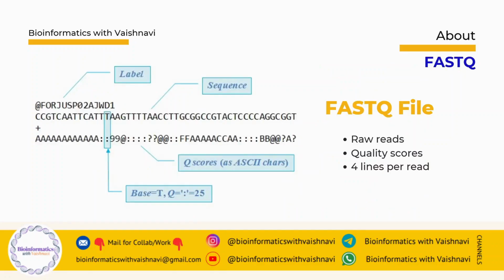So first, FASTQ. FASTQ is raw data that comes directly from the sequencing machine. जब हम अपना सैंपल सीक्वेंसिंग मशीन में लोड करते हैं और उससे जो डेटा जनरेट होता है, जो सीक्वेंसिंग होने के बाद जो हमारे पास डेटा आता है, वो FASTQ फॉर्मेट में होता है. It's just raw data. No explanation, nothing else. Just raw data files. Hundreds of reads in one folder, just data.